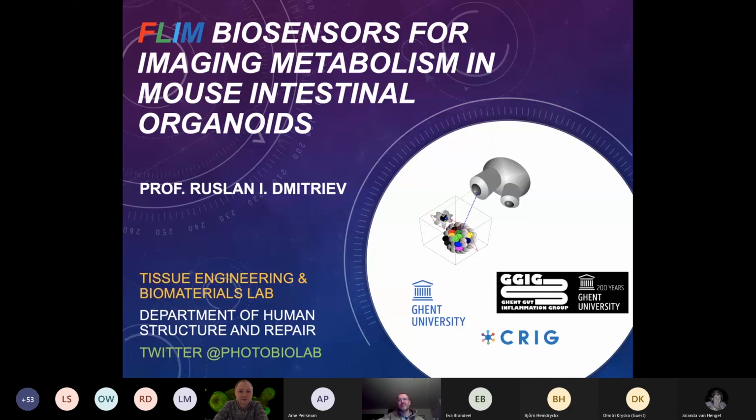I'm a starting professor and lead the tissue engineering and biomaterials lab at the University of Ghent. And today I'm going to talk about biosensors for imaging metabolism in mouse intestinal organoids.